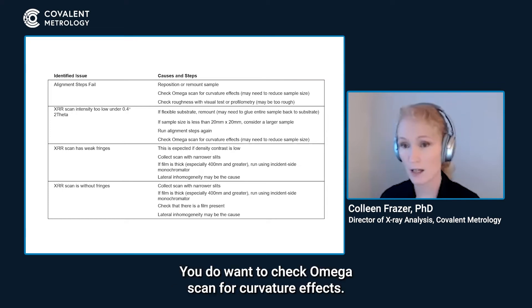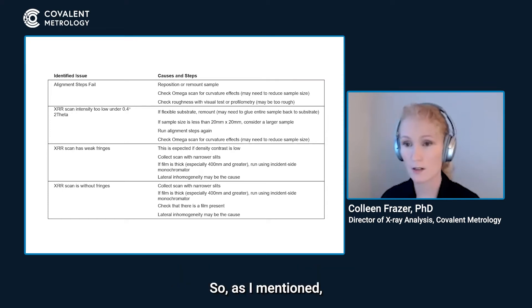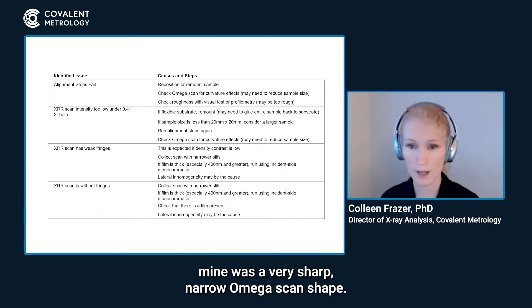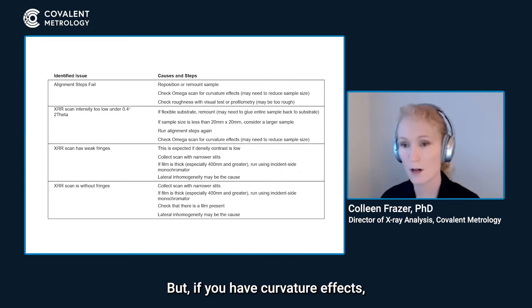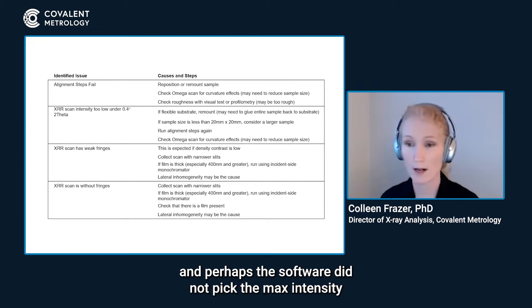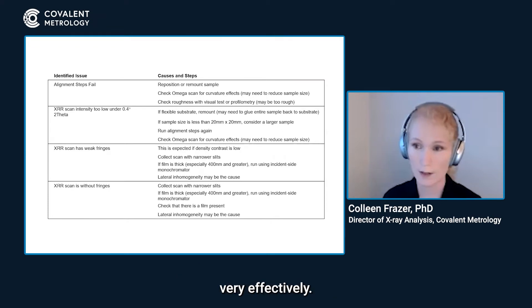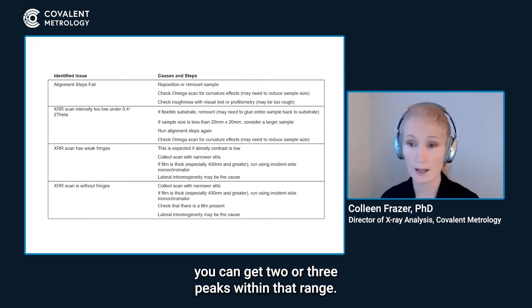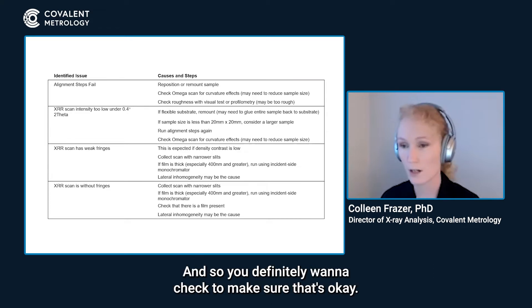You do want to check the omega scan for curvature effects. Especially in the direct beam measurements, mine was a very sharp, narrow omega scan shape. But if you have curvature effects, you might see a very wide peak and perhaps the software did not pick the max intensity very effectively. You can also get, for a regular curvature, two or three peaks within that range.